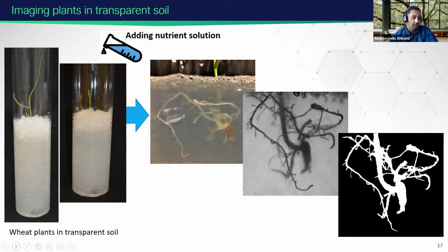So we confirmed that growing plants in transparent soil here produces roots more like the ones grown in real soil. And it also provides high transparency and good mechanical stability for us. And it is made relatively easy and with low cost. So there are potentials here to invest more time and employ transparent soil for automated root imaging in our future studies.